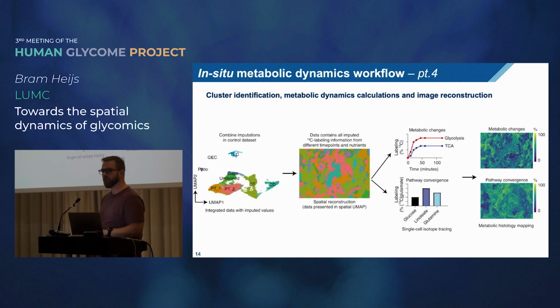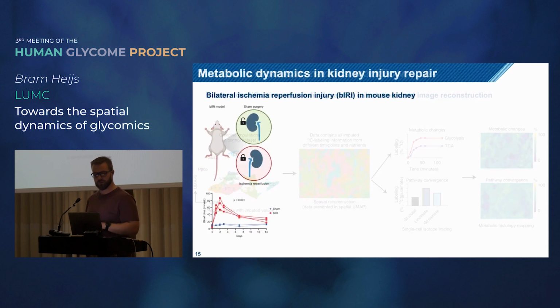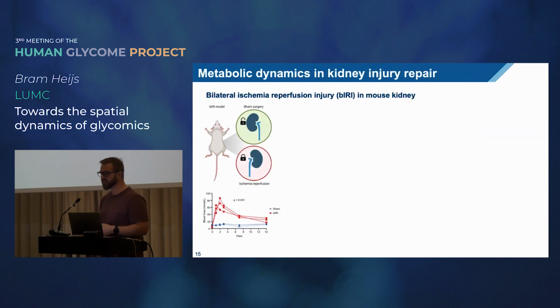And now this method is all very nice, but a method is not really useful if you cannot apply it, so we chose to apply it, since it was a collaboration with the nephrology department, to a model for acute kidney injury.